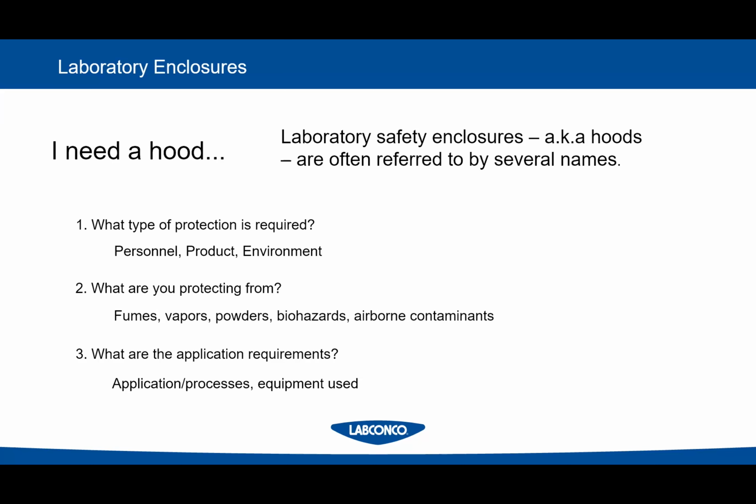And the last question is, what are the application requirements? Are you going to put something in here that makes a lot of heat? Do you need a lot of tubes and hosing and service fixtures and all those good things that we can put into different enclosures? What process are you doing? Does somebody need to sit at this all day versus just walk up to it for 5 minutes? What all do we have to consider in this enclosure and how it's going to be used?